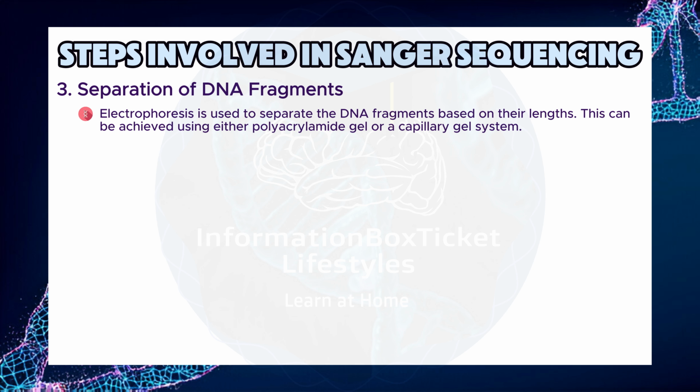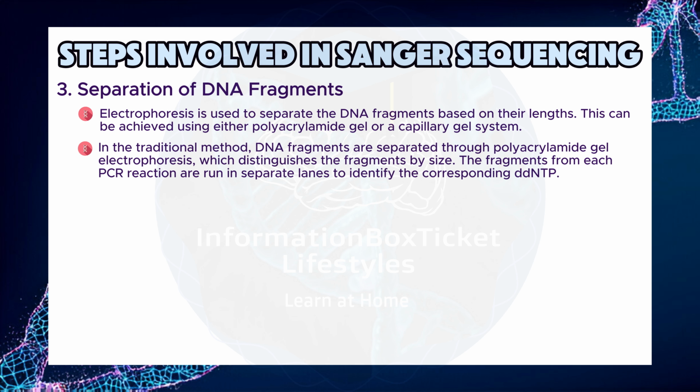3. Separation of DNA fragments. Electrophoresis is used to separate the DNA fragments based on their lengths. This can be achieved using either polyacrylamide gel or a capillary gel system. In the traditional method, DNA fragments are separated through polyacrylamide gel electrophoresis, which distinguishes the fragments by size.